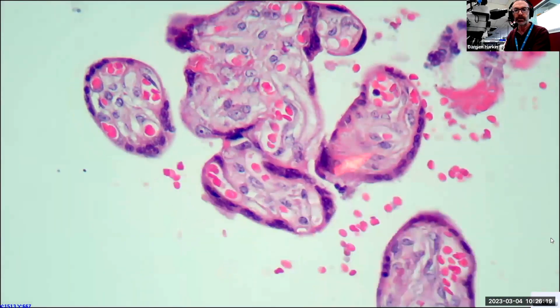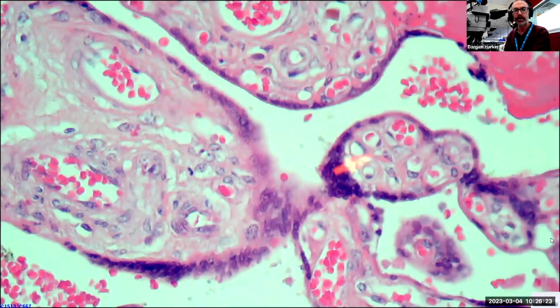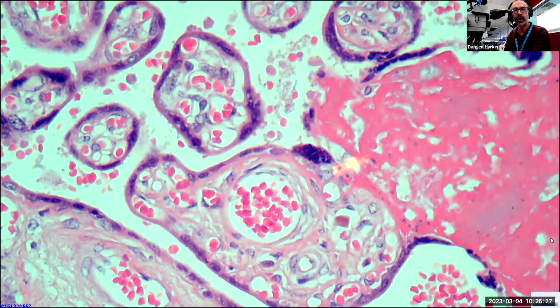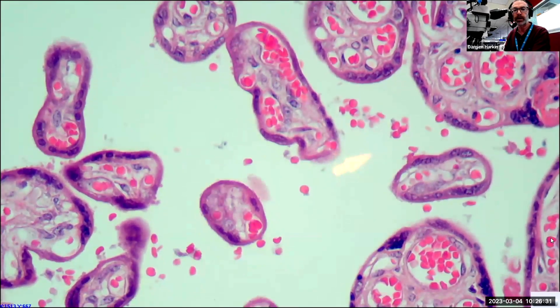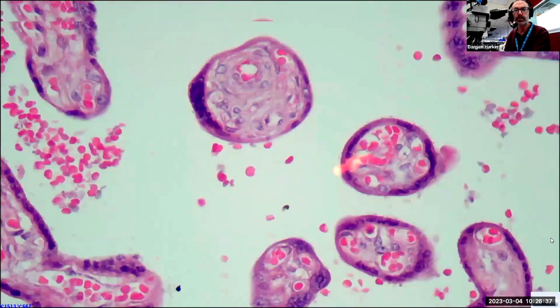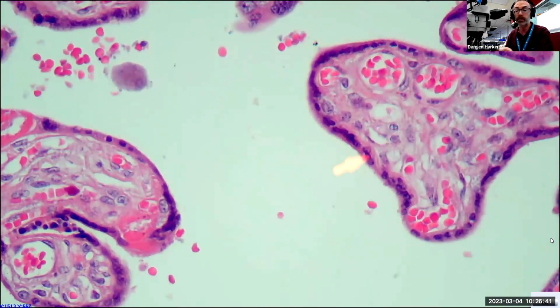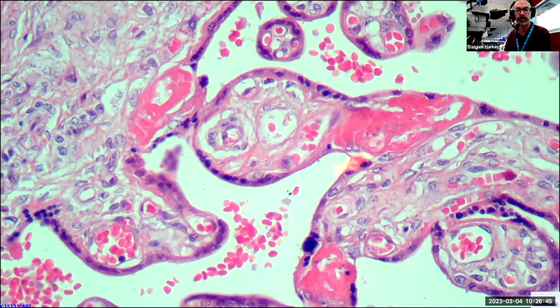So let me go a bit further to convince you. Yeah, so I think you get the idea there. There may be small traces, but we're certainly not seeing those large globular looking structures that we saw before. And bearing in mind, there might be a little bit of precipitated hematoxylin in there as well, which obviously won't necessarily be removed using this particular technique.